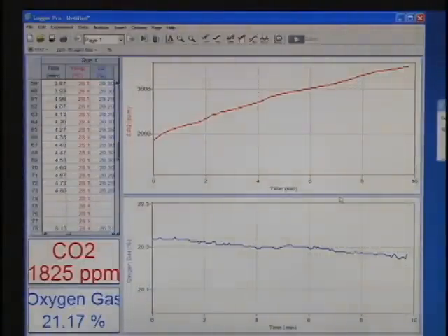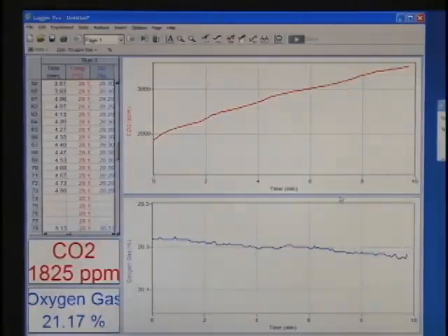To determine the rate of respiration for the peas, we'll need to fit a linear fit to our data. Click on the top graph, the CO2 graph, to select it.